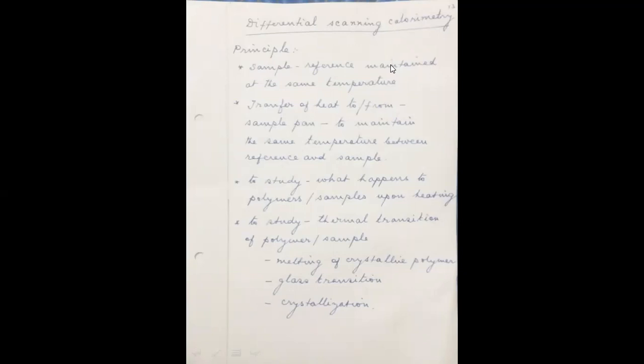And also the crystallization procedure itself. Some crystallization will take place at an elevated temperature, and an excess amount of heat energy has to be supplied for the crystallization. So on such occasions, when you keep a substance which is to be crystallized and the other substance as the reference and put them together, an additional supply of heat energy is required to the sample pan to initiate the crystallization and for proceeding with it. So such additional supply of heat energy for the crystallization can be followed using the differential scanning calorimetry.